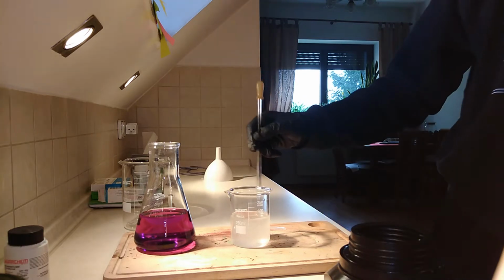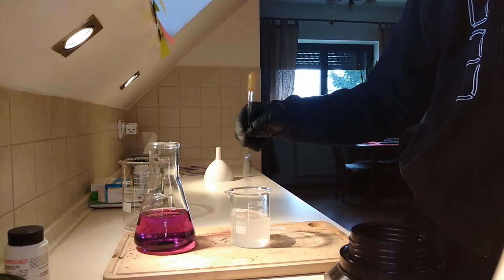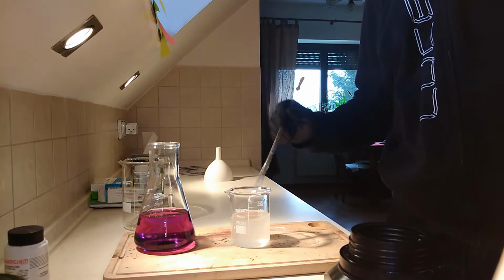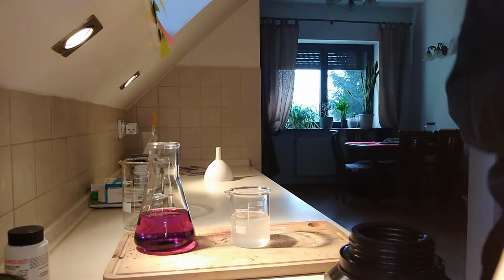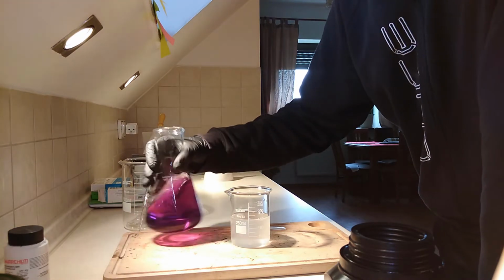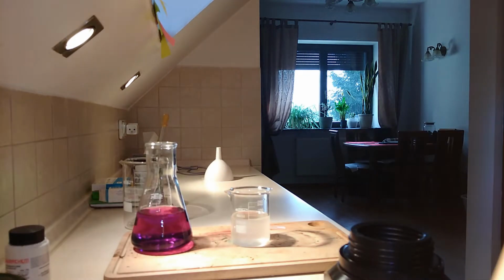And obviously, don't panic. If you spill some on yourself, just rush to the nearest water station, a tap or a shower, and wash yourself. If you got some in your eyes, just wash them out, and you'll be fine.